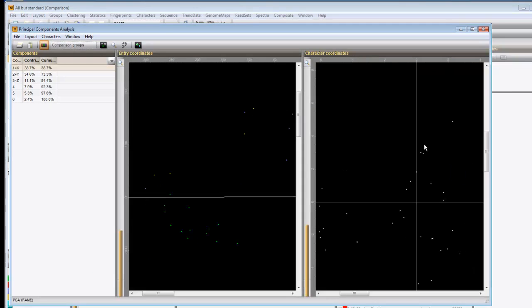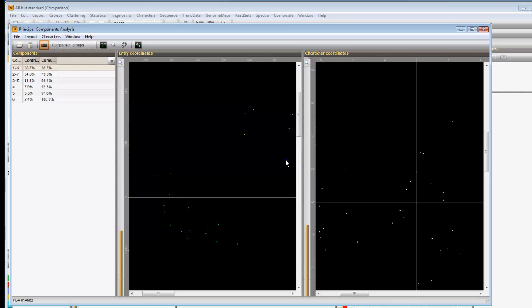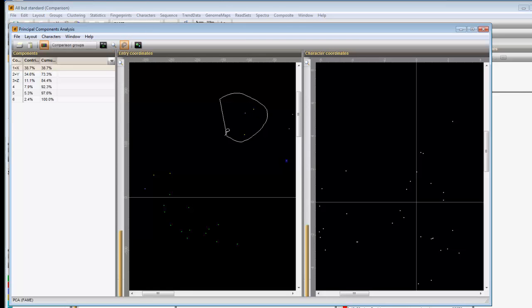Entries can be selected by clicking on one with the control button held down. Or a more flexible way, by selecting the lasso tool and drawing a shape around a group of entries. The selection is interactive with the underlying comparison window.